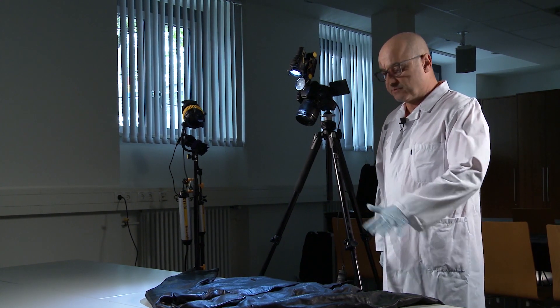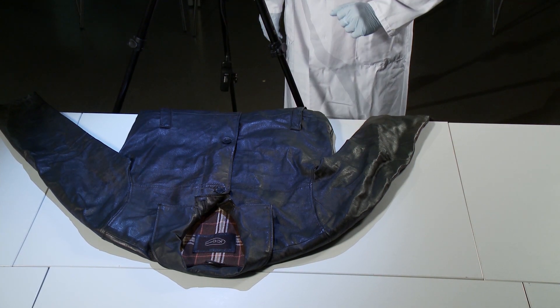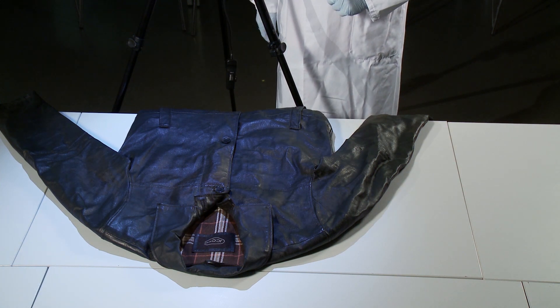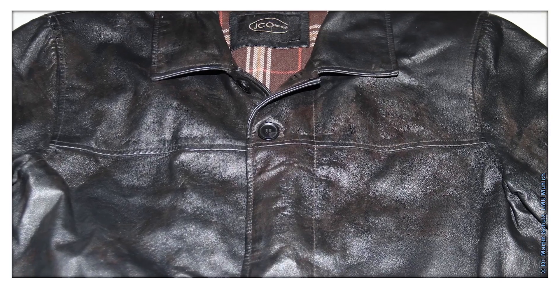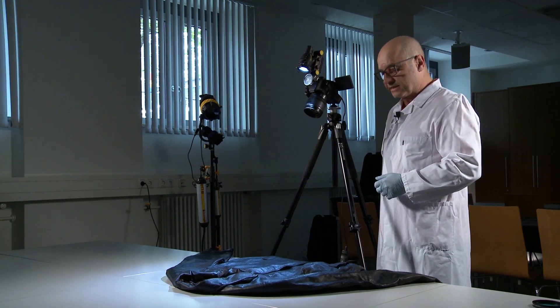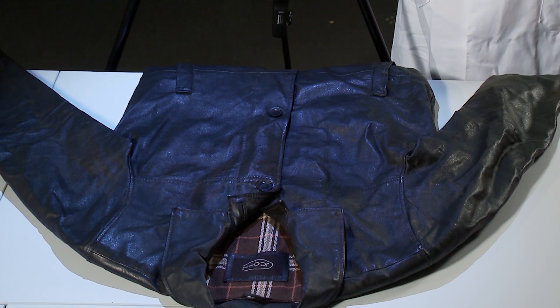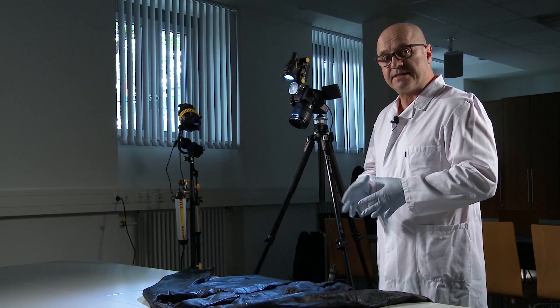Wir haben eine schwarze Lederjacke mit Blutantragungen drauf. Das Grundproblem bei so einer Lederjacke ist zum Beispiel schon die glänzende Oberfläche. Wir haben sehr viel mit Reflektionen zu kämpfen, und egal von wo ich beleuchte oder welchen Blitz ich verwende, ich werde immer Reflektionen haben. Das zweite Problem ist natürlich, dass die Blutspuren auf dem schwarzen Leder einen ganz schlechten Kontrast bilden und ich bei Normalbeleuchtung so gut wie kein Blut erkennen kann. In solchen Fällen ist es ratsam, mit polarisiertem Licht zu arbeiten.